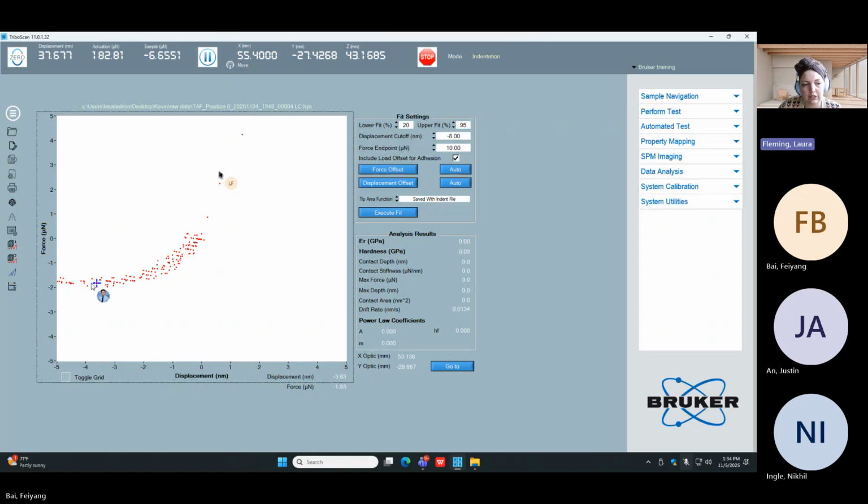Do you see how the reticule moved when you clicked? I'm pointing out that when you click here, the reticule is there, versus when you click here, the reticule updates with you. It moves. Because what we're going to do next, don't do it quite yet, is hit Control G. When you hit Control G, it takes wherever that reticule is and says, that's 0,0.